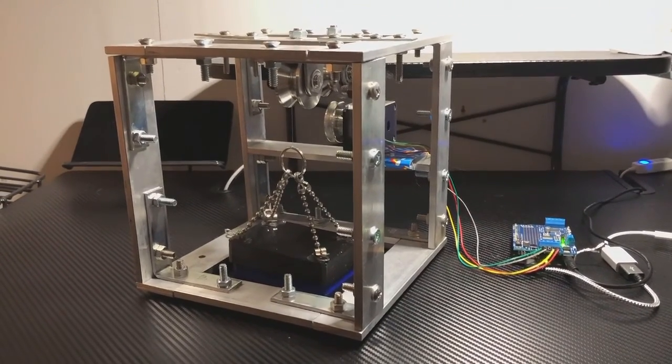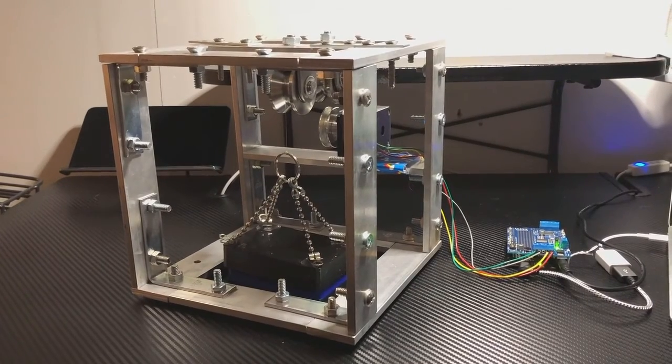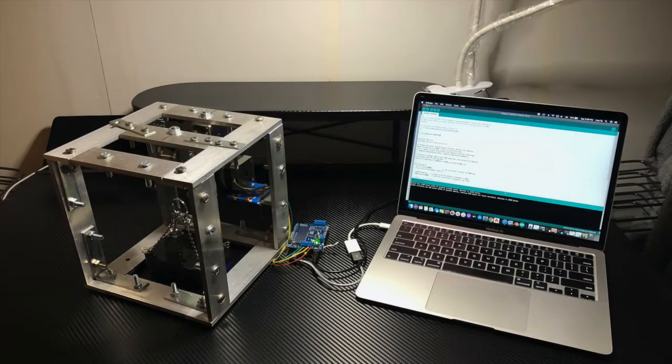To conclude, this bioreactor was created with the intent to contribute to expanding opportunities for personalized cell-based therapies. This would bridge the gap between currently researched solutions with a clinical application for patients who seek alternatives to their treatments.